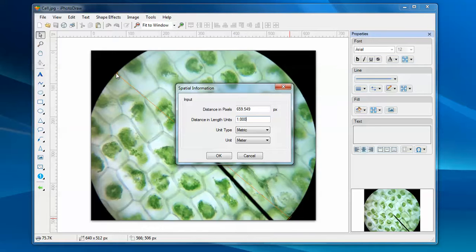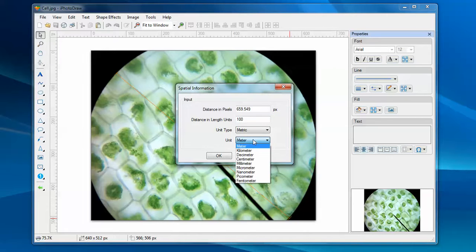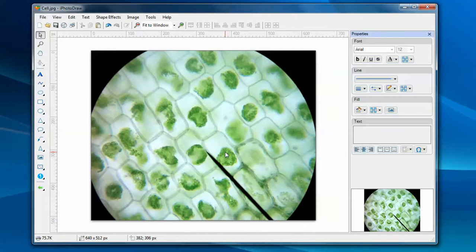For this image, I know the diameter for this microscope is 100 micrometers. So I just enter 100 and pick the unit from the dropdown box. Now the spatial information is defined.